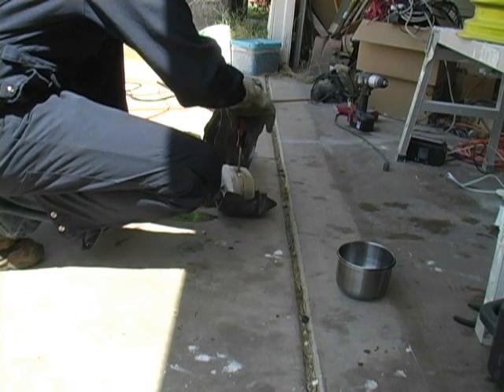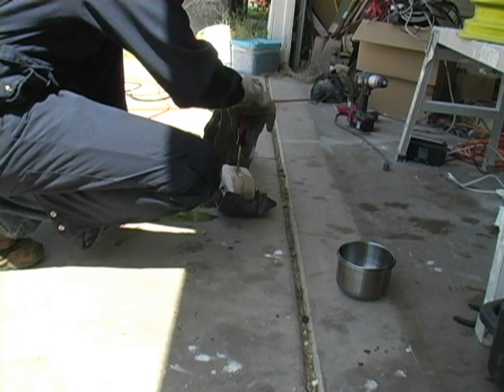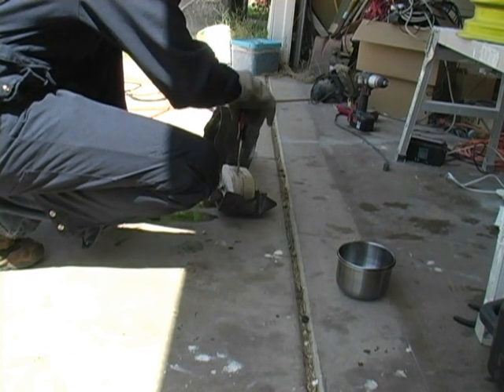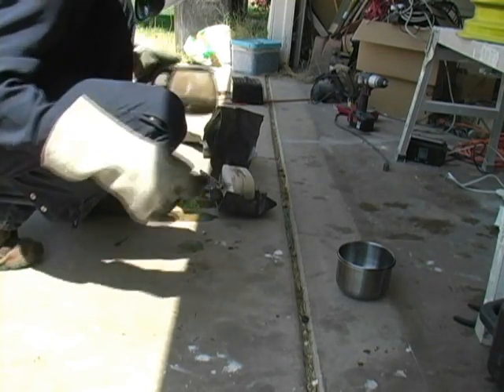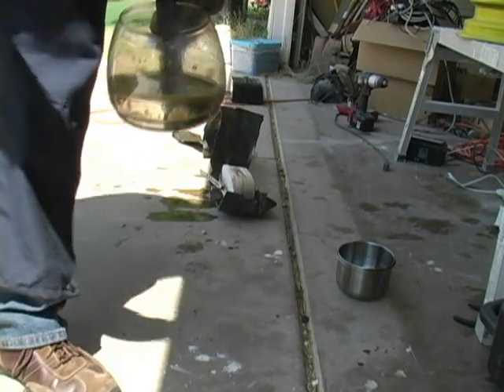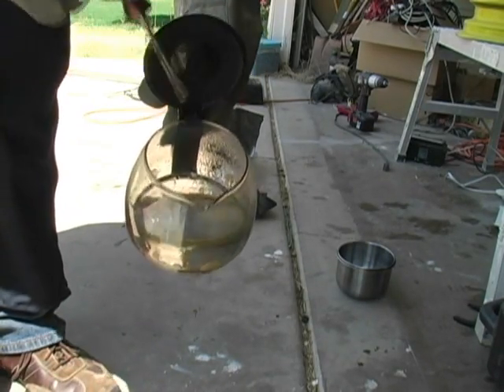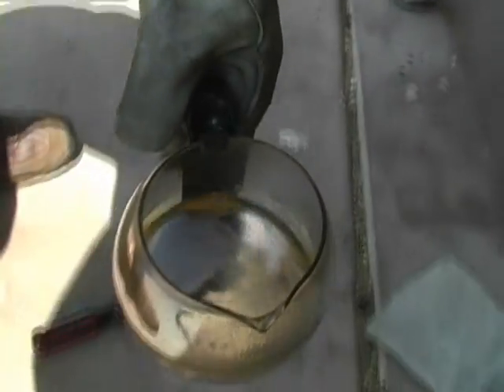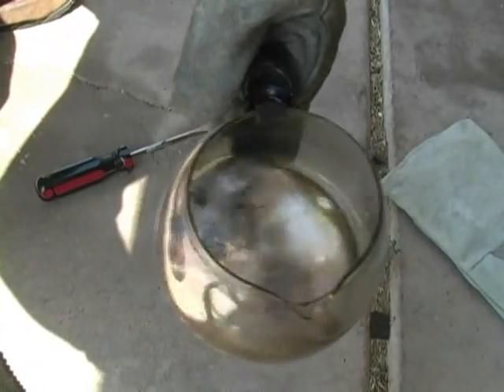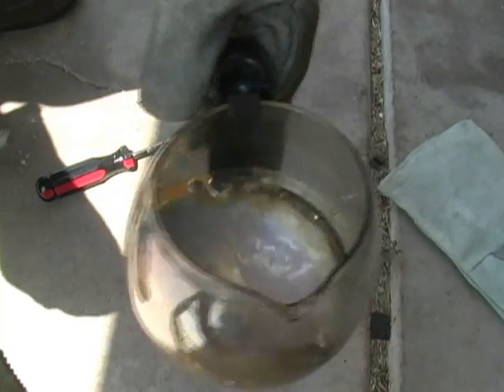I wish I hadn't put so much hydraulic fluid in there, but you've got to keep it from oxidizing. Let's see if I can get you a close-up of what that looks like on the inside. Isn't that pretty? That's just pure sodium, other than a little bit of hydraulic fluid. See the skin that's happening on the top? That's because I don't have any hydraulic fluid on the top — it's oxidizing.